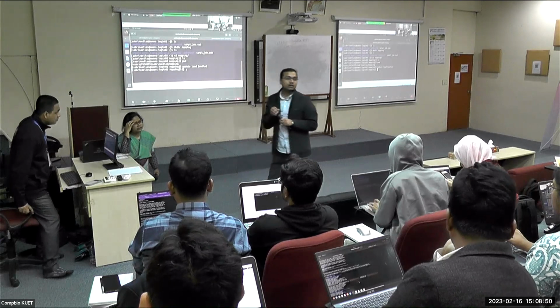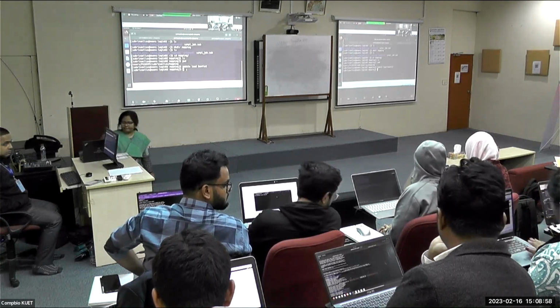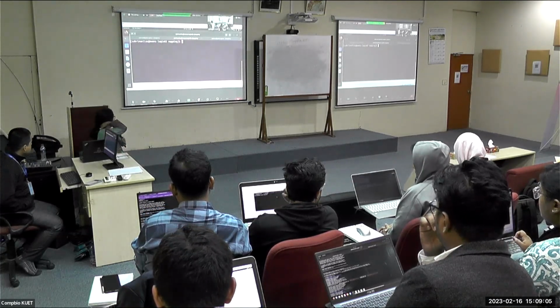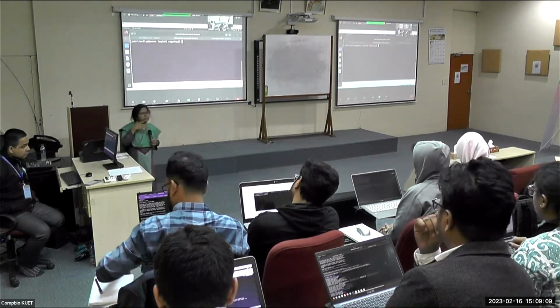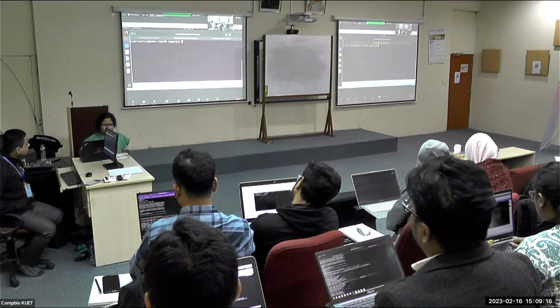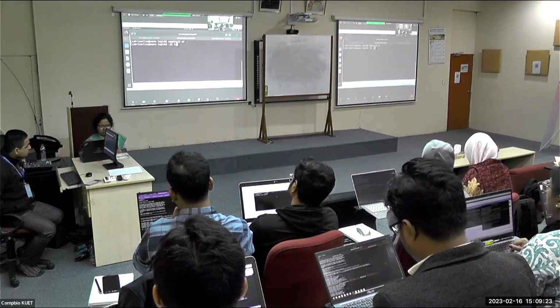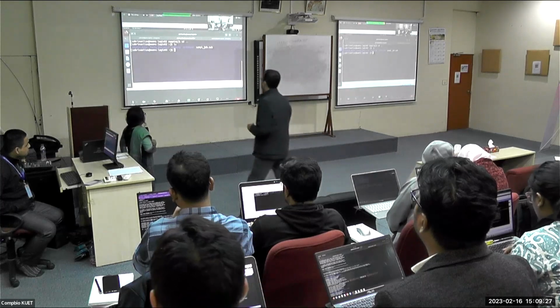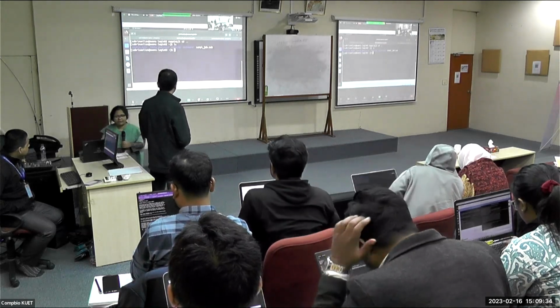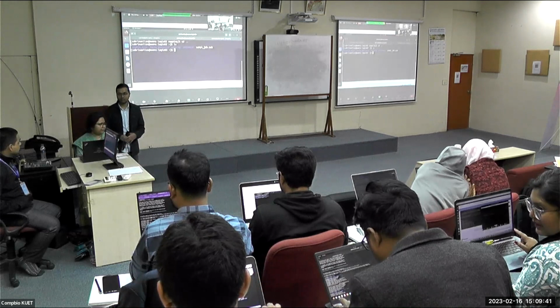The upload is done, we are waiting a bit until everyone else is together. So now we can construct the sbatch file and we can just write. You can make it anywhere. For example, mine is not inside the mapping directory, so I'm going outside here. You can follow the address that I am writing. You can just write the file outside the mapping directory.